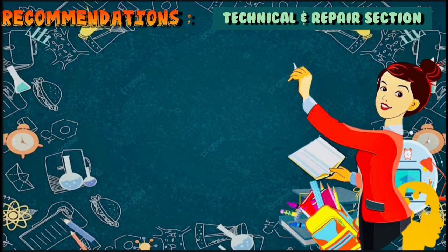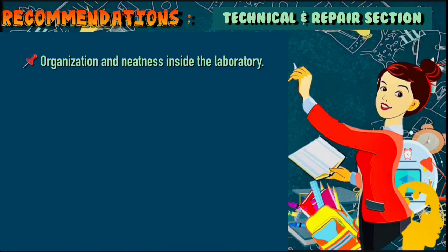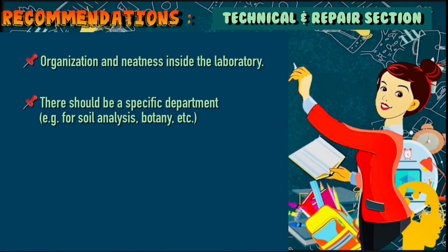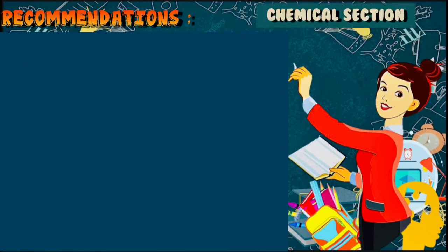Recommendations. Technical and repair section. First, organization and neatness inside the laboratory. Next, there should be a specific department, for example, for soil analysis in botany. And lastly, the laminar flow cabinet should have a HEPA or high efficiency particulate filter, which is a type of mechanical air filter that theoretically can remove at least 99.97% of dust, pollen, mold, bacteria, or any airborne particle with a size of 0.3 microns.